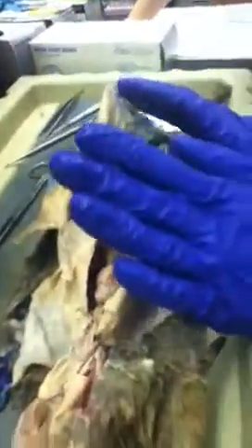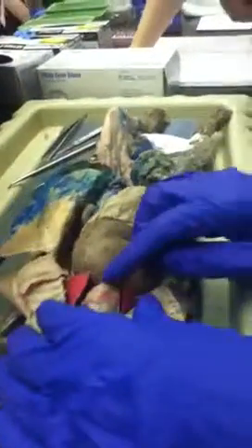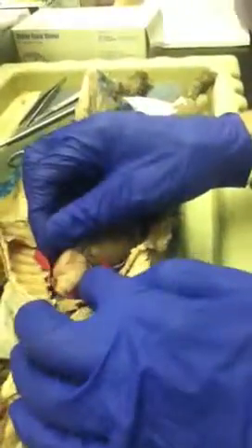Now there are two categories of peritoneum, visceral and parietal. Viscera is guts. So the peritoneum on the surface of the guts is visceral peritoneum, and the peritoneum on the surface of the cavity is parietal. When you get to things like the heart and the pericardial cavity, it's called parietal pericardium and visceral pericardium. The visceral pericardium is the surface of the heart. Parietal is this membrane that surrounds it.